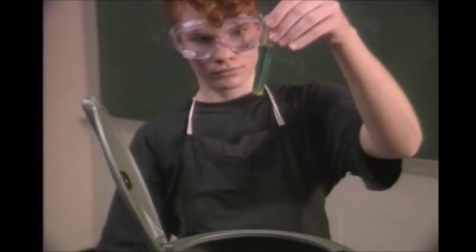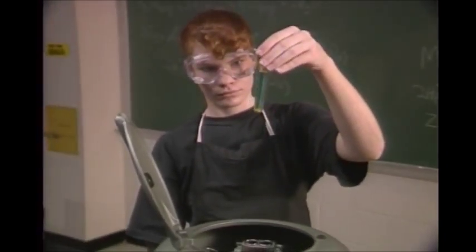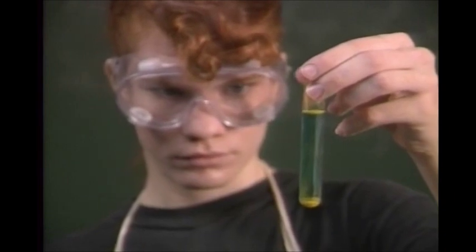A centrifuge spins mixtures around in test tubes to separate solids from liquids. The solids move out toward the bottom of the tubes, and the liquid stays on top.